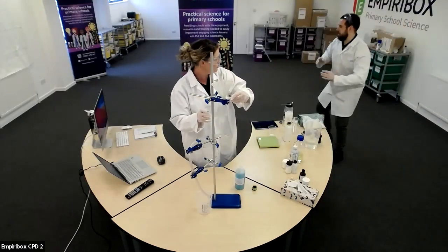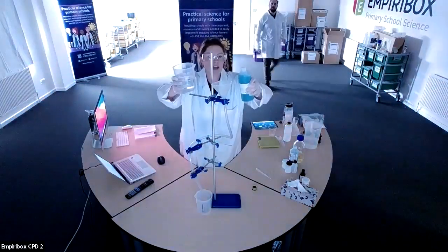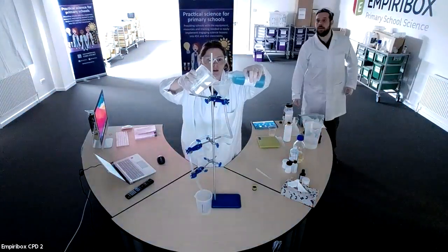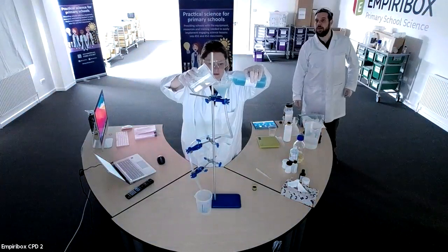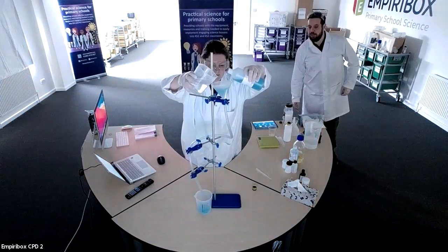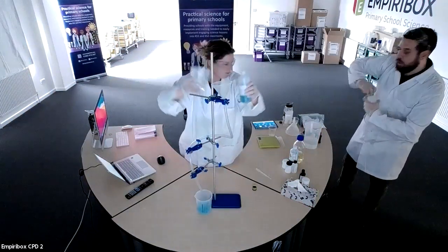Do you want to hit the light? Yeah, we'll hit the lights. Okay, so hopefully when we put these two chemicals together in the top, you should see something happen as the chemicals react. Is it not shining through that clearly? Hold on. No, that's all right.